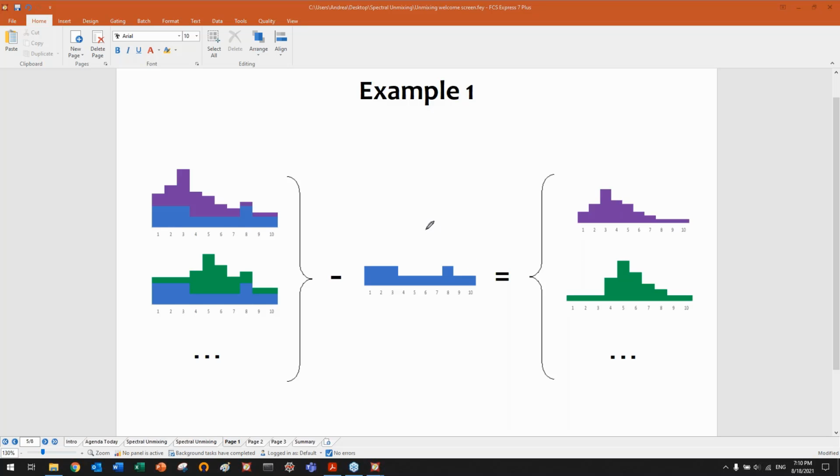So even when you stain your cells or your beads with a single dye, a single fluorochrome, what you read is this one. So the spectrum is still composed by the autofluorescence. And then on top of the autofluorescence, you have the actual spectrum of the dye, let's say FITC.